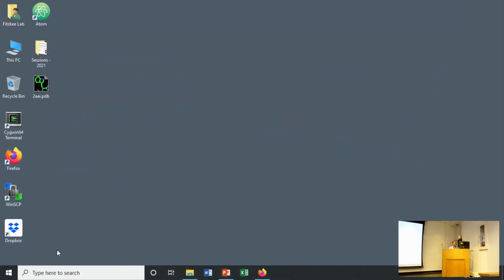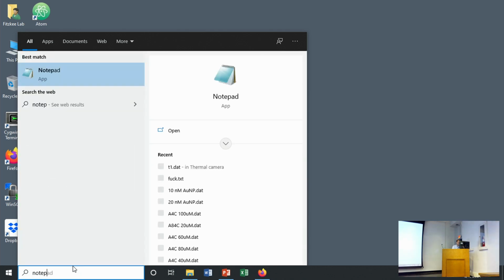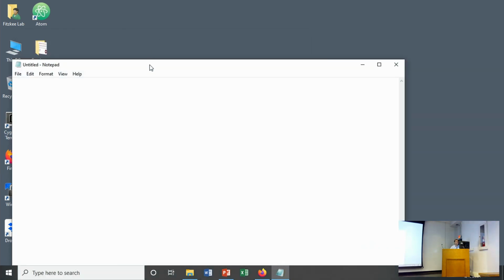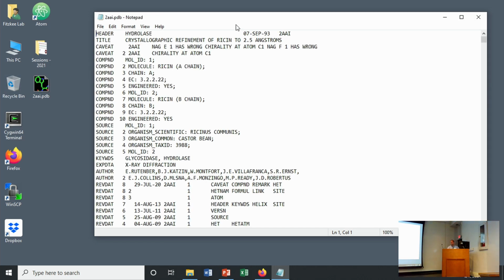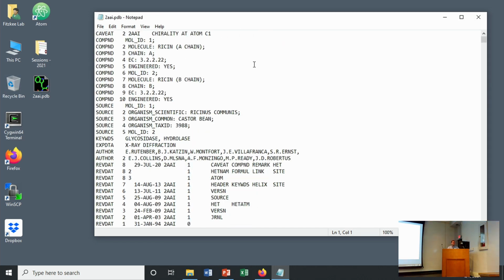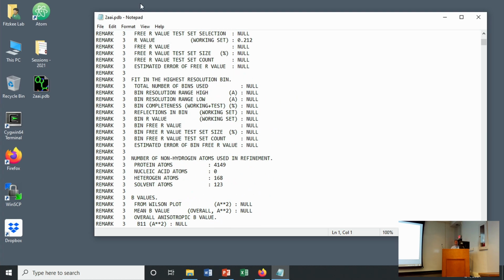There's very little in science that is difficult to understand or hopelessly complex, unless you're talking about quantum mechanics. But if I look at this file, I can just bring it up in a text editor, right? And so don't be afraid to look behind the curtain. As scientists, we're naturally curious. And so think about how these files are storing the data that they store.